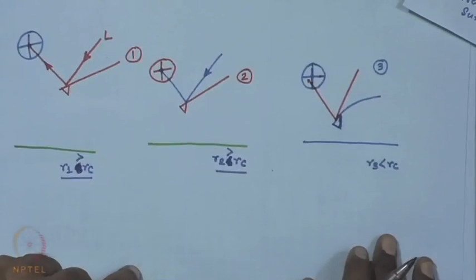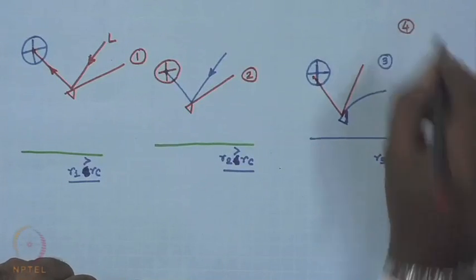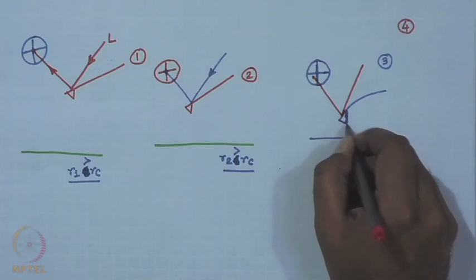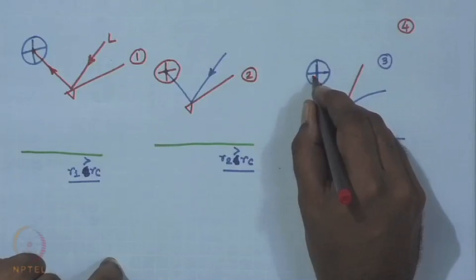So, if you compare with the fact that at perfectly aligned condition the deflection was 0, you already see that because of this deflection corresponding to the attractive force experienced by the tip due to the approaching surface, there is already a shift in the laser light.